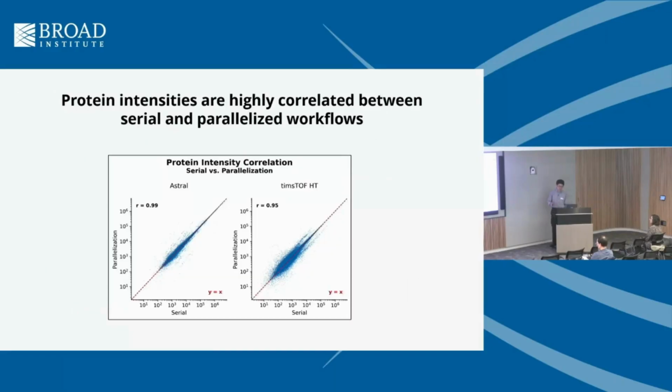And for quantification, we're plotting the protein intensities from the parallelized workflow on the y-axis, and from the serial workflow on the x-axis, and then we're calculating the correlation coefficient, and we're seeing very strongly correlated protein quants between these two workflows. So we're very confident that the parallelized workflow doesn't sacrifice analytic performance for the speed and cheaper cost.